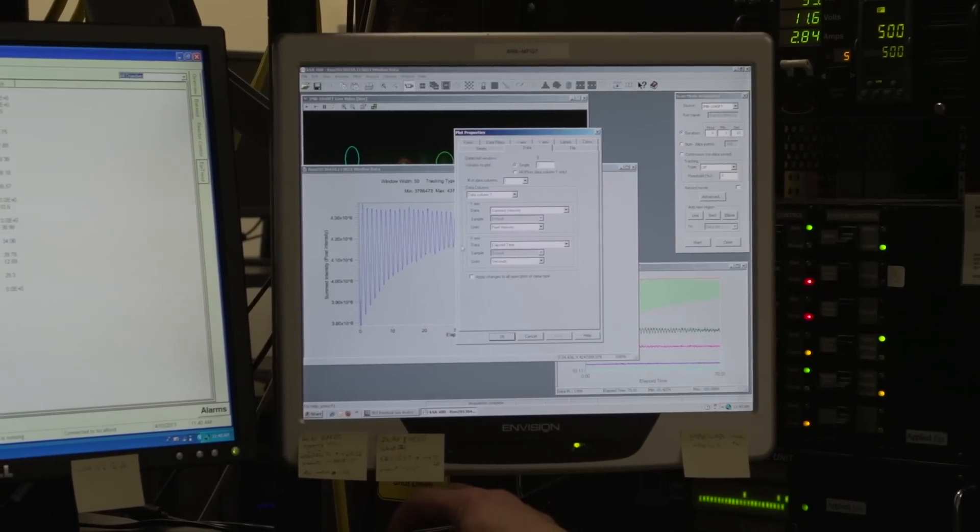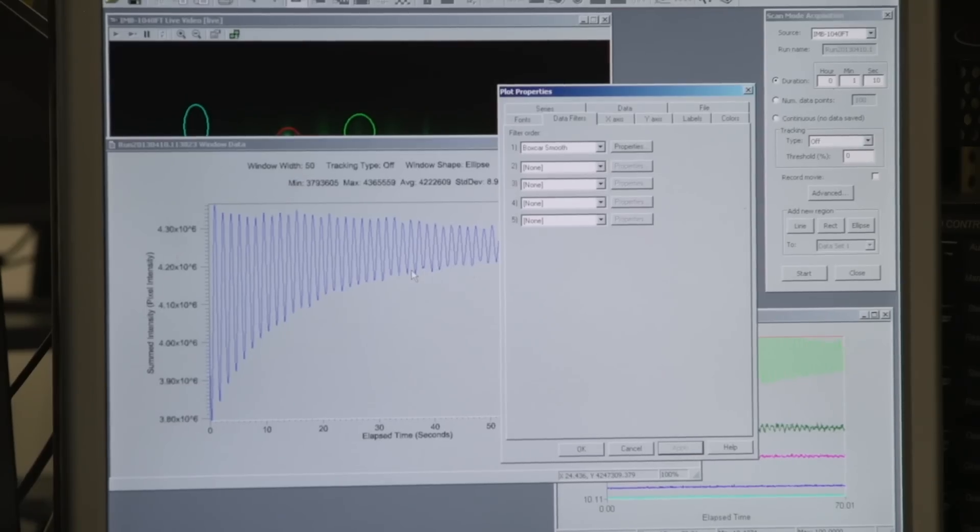And now comes the part that makes my life really easy. I click on a couple of buttons, and it tells me what the frequency of oscillation is. It's a very powerful, real-time tool for monitoring the evolution of the electron diffraction pattern.